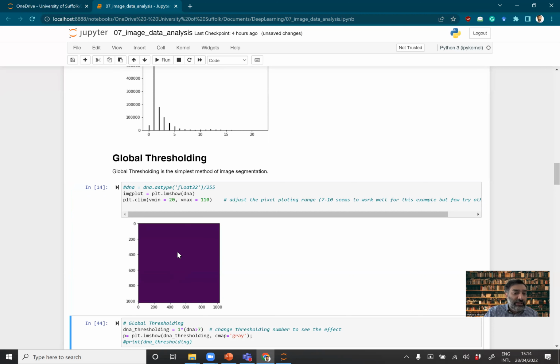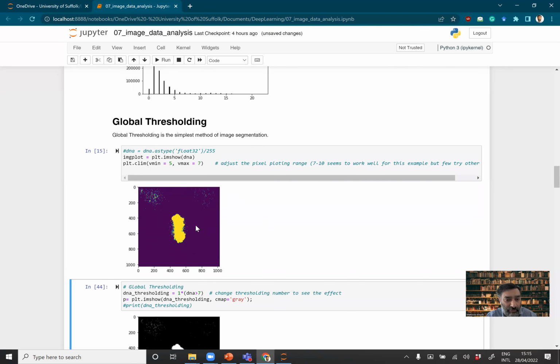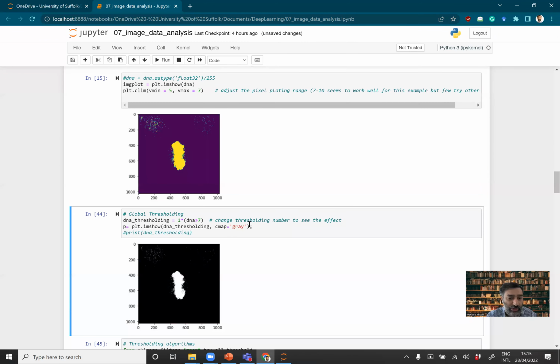So there's nothing. Basically this will allow you to try different numbers and see where your region of interest is. What are the pixel values? So have a play with different numbers, 5 and 7. And I can now see that, yes, between these pixel values, that's where my region of interest is. My region of interest consists of the values in between this range. So this is a manual way of having a play with the different pixel values, just to see where my region of interest is.